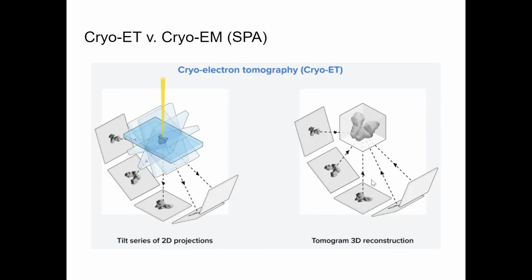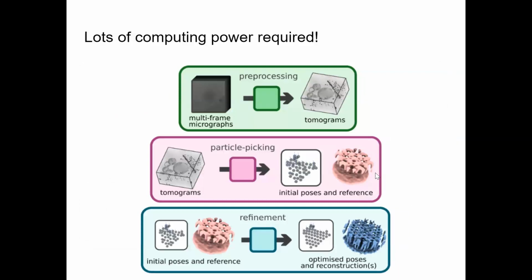This means that scientists need to be able to take, store, process, and analyze large amounts of these photographs. These leaps in storage and computing power have made it possible for scientists to take advantage of cryotechnology and electron microscopy to study important cellular and subcellular particles with ever-increasing resolution. Nowadays, single-digit angstrom resolution is possible with Cryo-E.T.